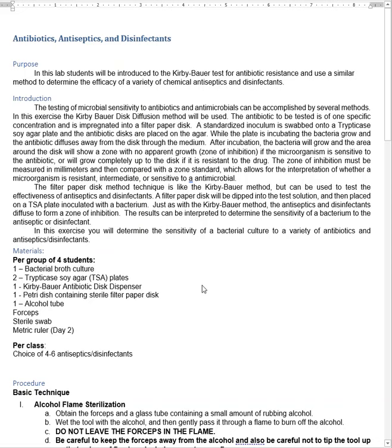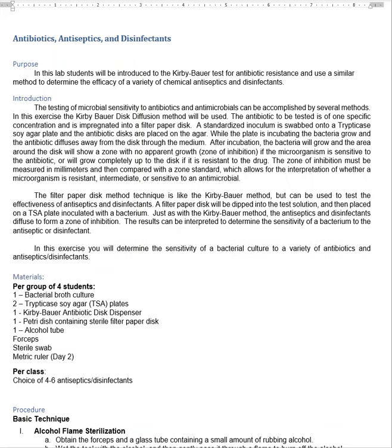Okay guys, we're going to talk about lab number 9, antibiotics, antiseptics, and disinfectants. We're going to go through this lab that describes how we can test antibiotics, disinfectants, antiseptics, whatever we like, to see how a certain specific bacterial species reacts to it, whether it's very sensitive to it, in which case it's going to suppress it a great deal, whether it's resistant, these guys grow right up to the antibiotic or the disinfectant and antiseptic, or whether it's somewhere in between, what we call intermediate.